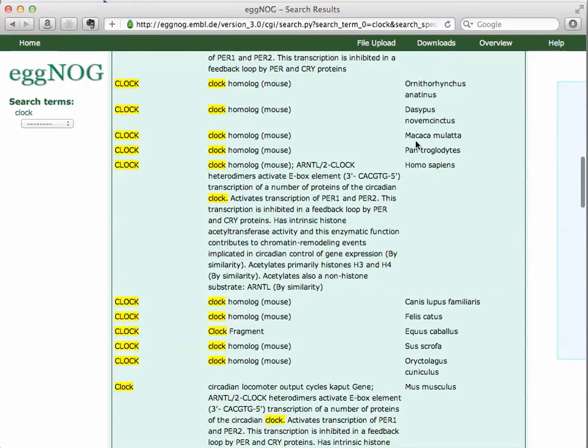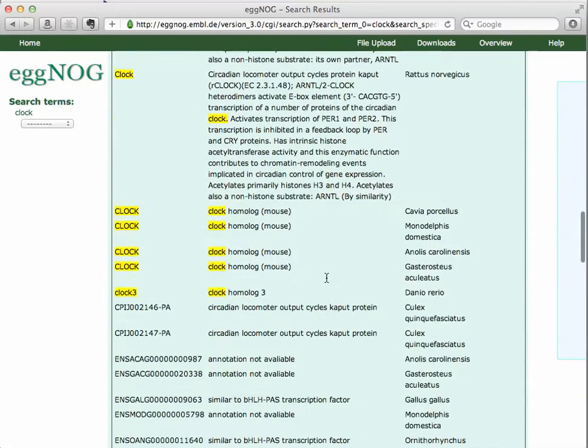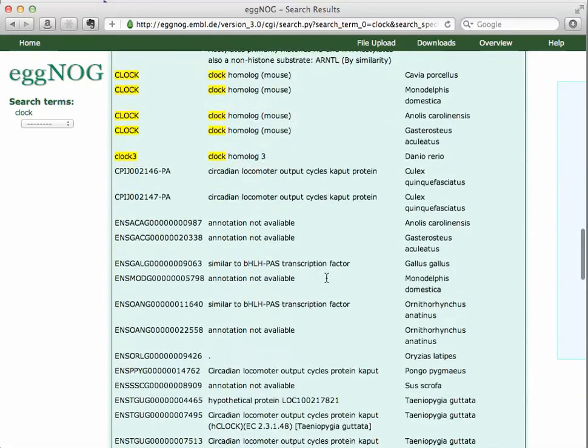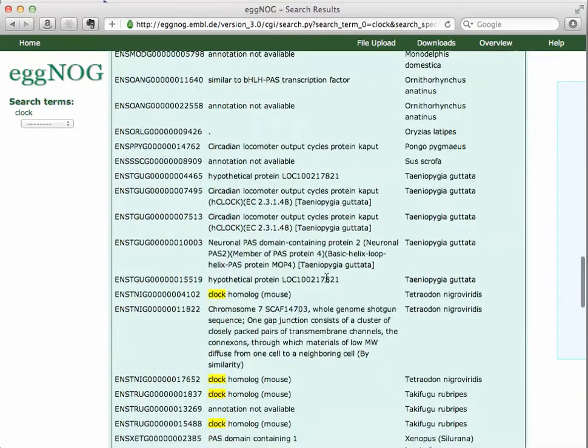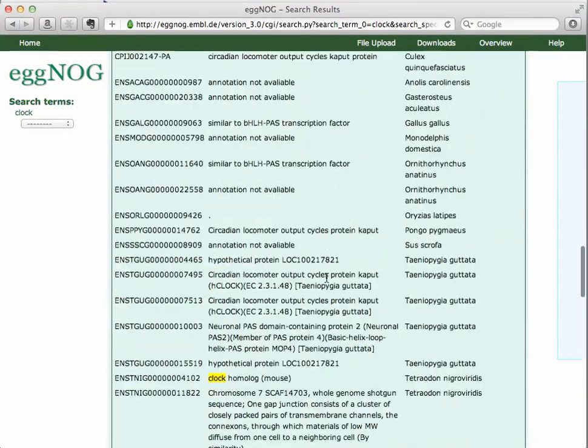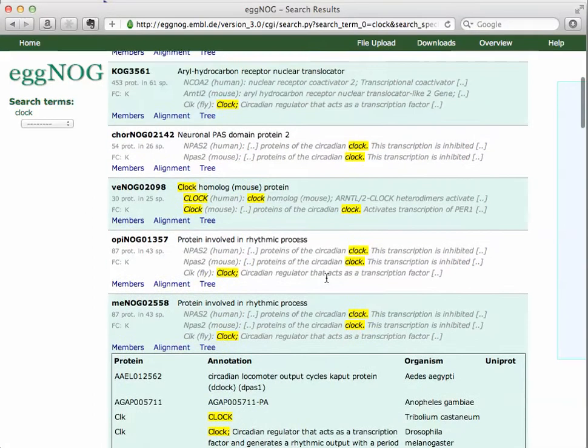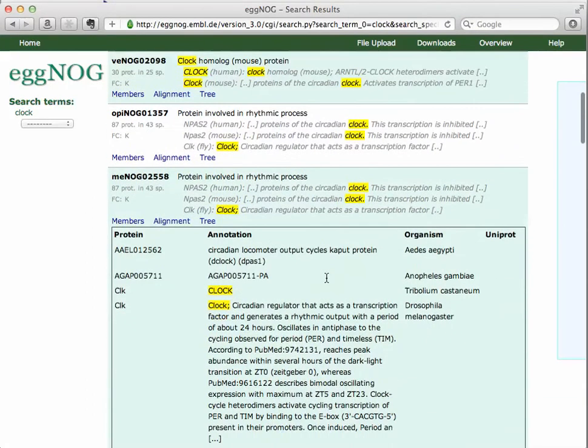orthologous members in the group, including the species they're from. Here's chimp, a COG, and human. It'll give you an idea and description of the gene, the gene name on the left, and the species name, as you see. So there's our orthologous group, and as it says, it has 87 proteins and 43 species.